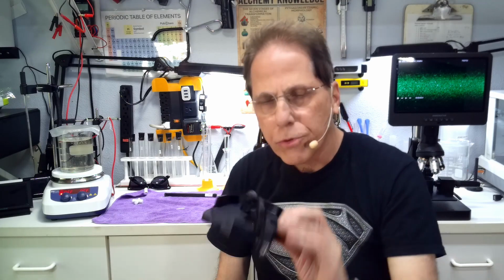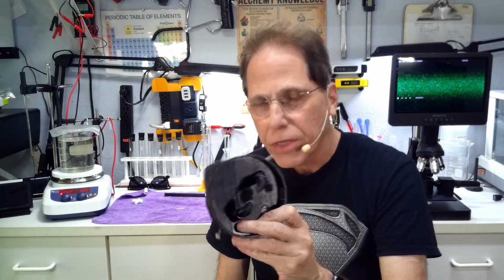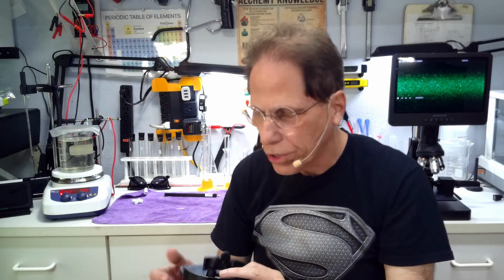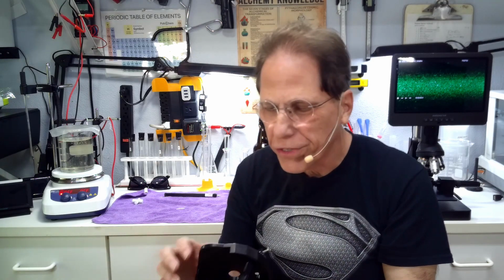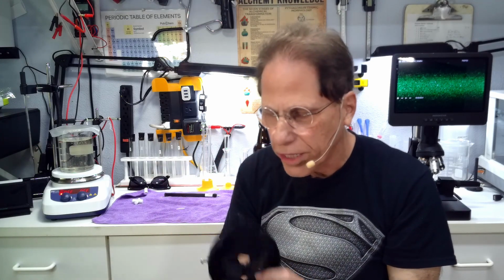Little things, like I had to put the distilled water for platinum anyway in the freezer, cool it down, because it seemed the arc was better able to conduct through cold water than it was through warm water. Once the water reached over 40 degrees C, the plasma arc seemed to be very sporadic and hard to maintain. That's one of the things that I found, but I'll find some other gems with it.